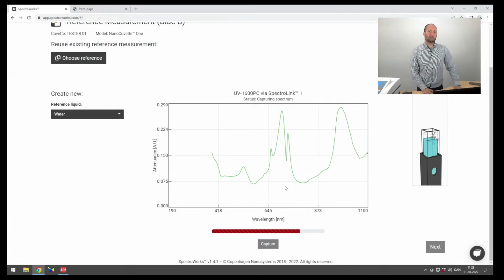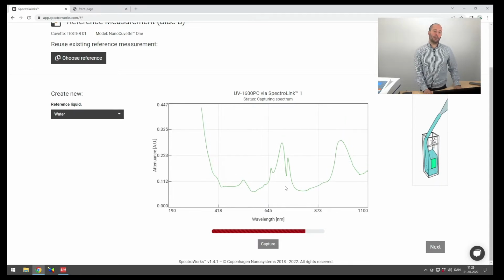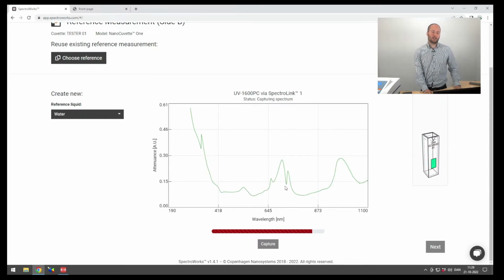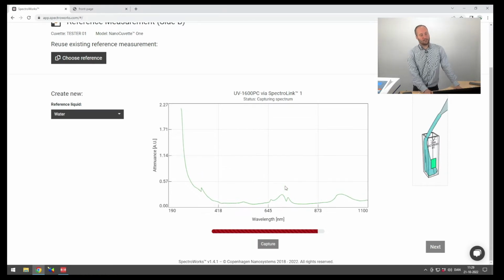Okay. And that's simply because, if we are targeting quality control, research or academia, you really want to know within a certain level of fidelity that what you get out is actually what you are measuring. You could push it and move forward below 75% in the quality fit, but we simply don't recommend it because we want to make best practice. Given that this is a relatively low-cost consumable, it's easier to just rinse it again and repeat the experiment, or discard it and take a new cuvette, right? It's not like you have to send off your instrument for calibration or anything like that.